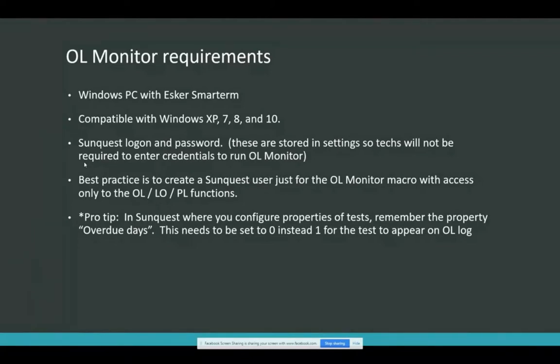A little pro tip: when you're in SunQuest and configuring the properties of your tests, you need to set the property of overdue days to zero. This will allow all of those tests to show up on the overdue log immediately instead of waiting a full day to be shown. The overdue log is a bit more organized than the pending log — the pending log is a little messy. The overdue log is great for automation, but you can also do the pending log with OL Monitor.